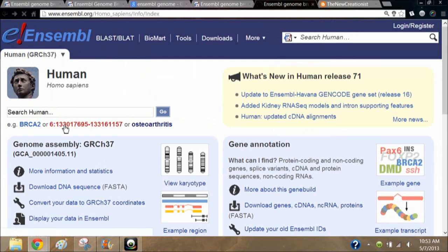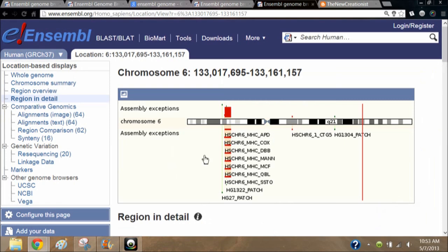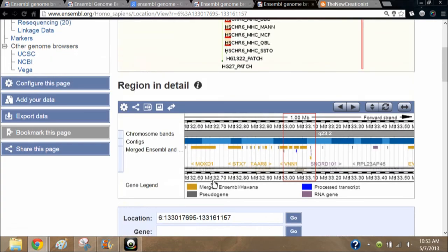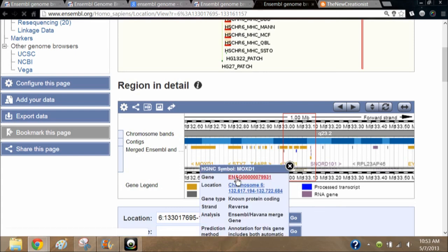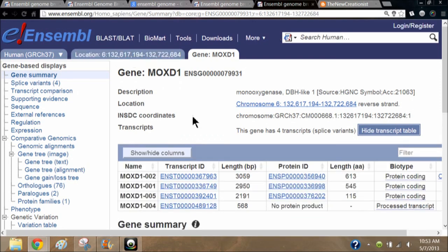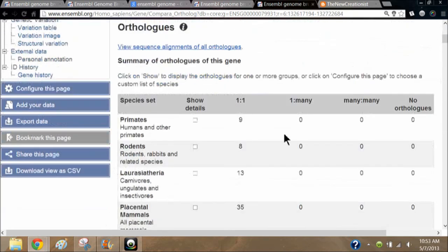There are other ways of going about this. If you click on the location, it takes us to chromosome 6 for human — here's another way you could pick out genes to run comparisons on. You could click here on the MOXD1 gene, or you could have clicked on the chromosome location. Here's the MOXD1 gene, and you could do the same thing: go to orthologs, scroll down, and get to the ortholog screen.